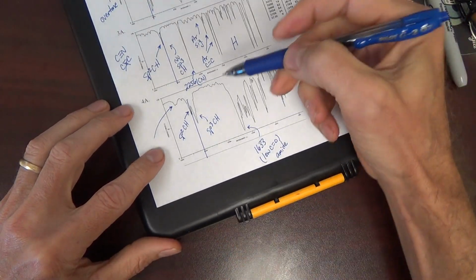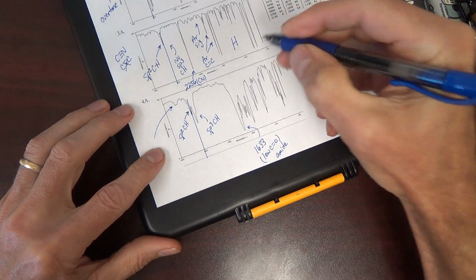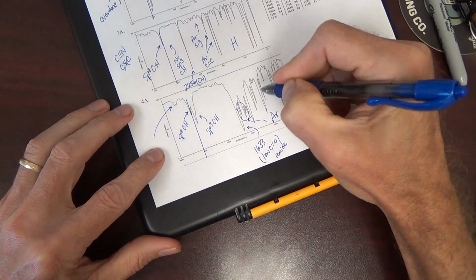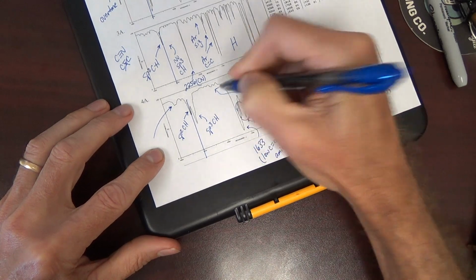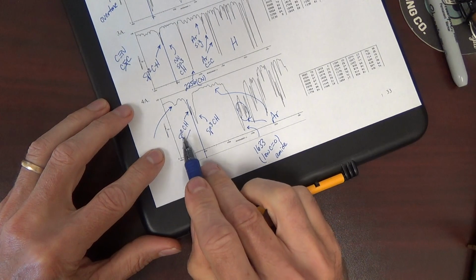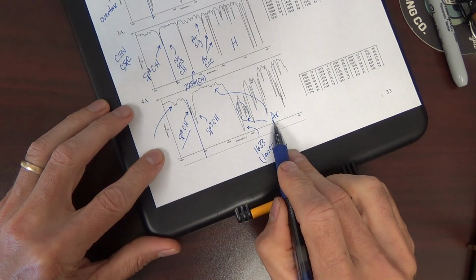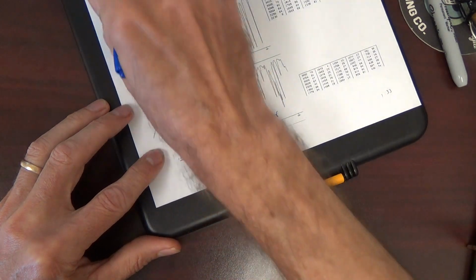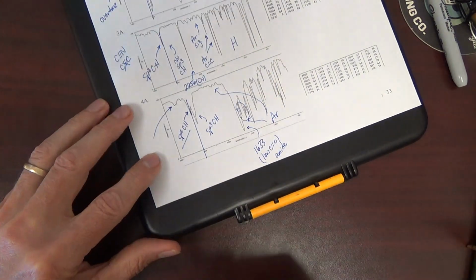Looks like an aromatic. We've also got peaks at sort of the 15, okay? Sort of in here, in this mountain range, looks like aromatic. We've got the sp2 CH, which sort of confirms it's aromatic. It doesn't really confirm it, but only if you're looking at something like that.